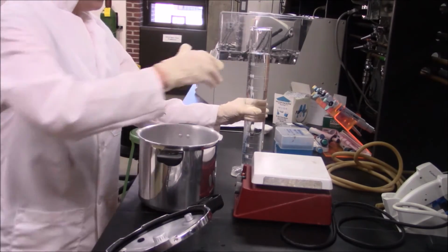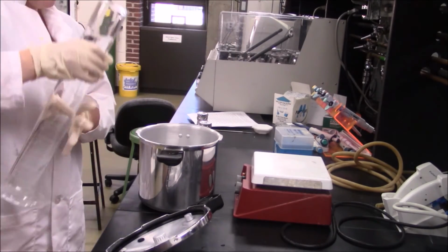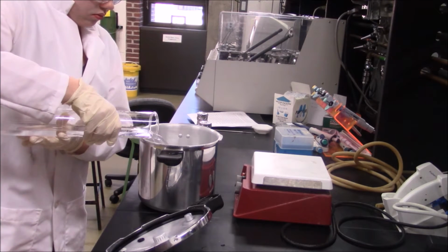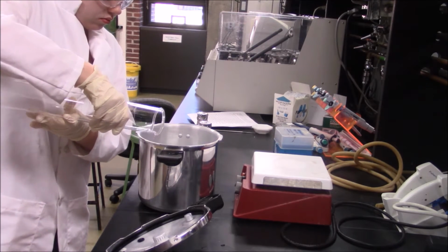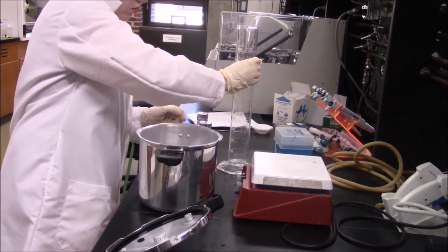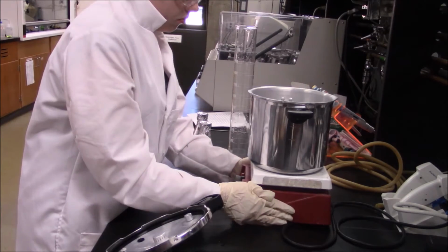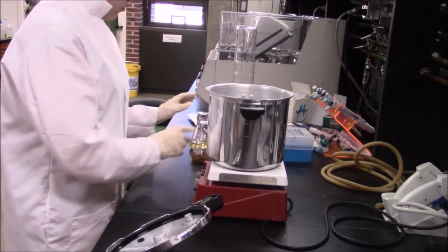Both flasks need to be sterilized before the addition of yeast to ensure that nothing else is consuming the glucose during fermentation, like bacteria contamination from the lab. Sterilization should be accomplished using the pressure cooker and hot plate. Conduct this step in a fume hood if available, otherwise on a lab bench.